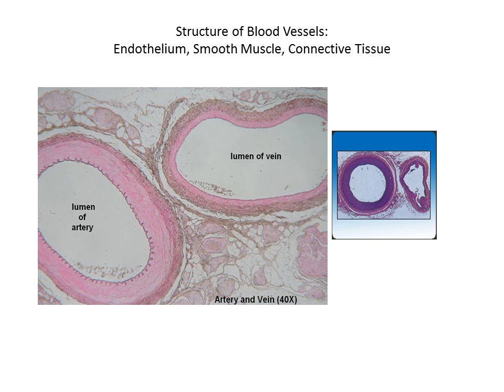You will be forced to tell the difference between an artery and a vein based only on their appearance. So, what is the big difference between an artery and a vein functionally? Contributions from the class? Pressure, yes, absolutely. Pressure because arteries do what versus veins doing what? Right, arteries push the blood through the system and veins are the drains. They bring the blood back.